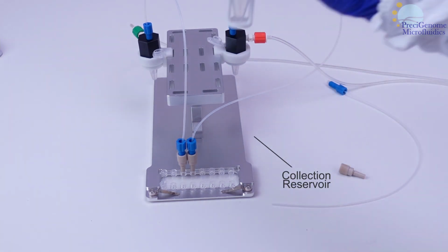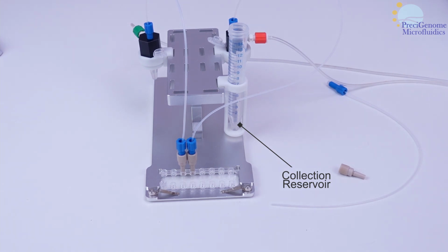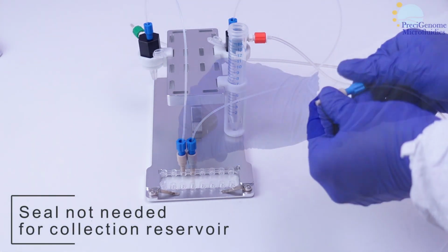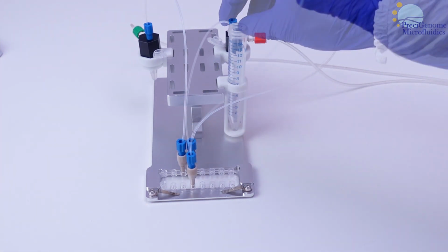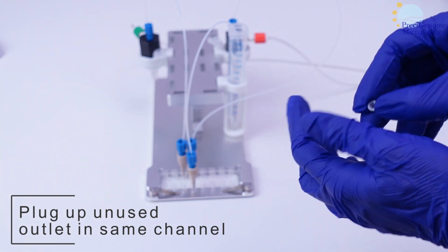We'll also need a collection reservoir, so prepare some more tubing in a similar way. We do not need a tight seal on this reservoir, though we will need to seal the rest of our chip channel. Plug its unused outlet using the cap included with the chip.